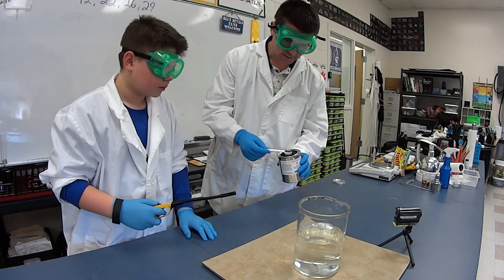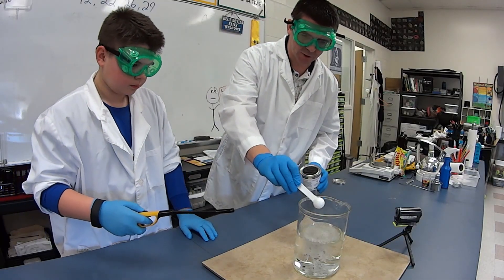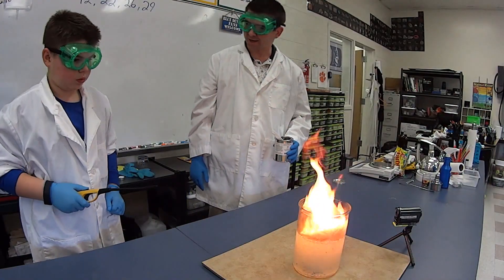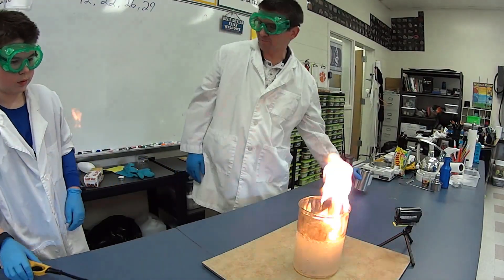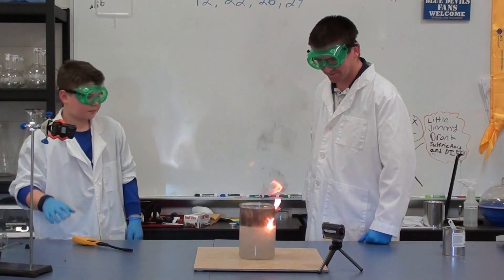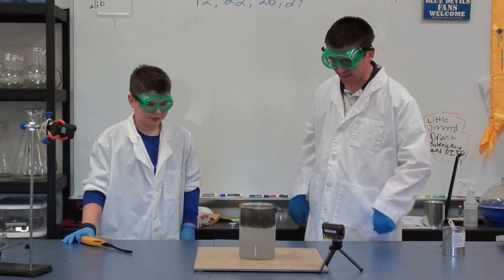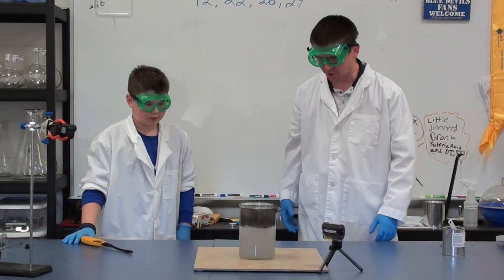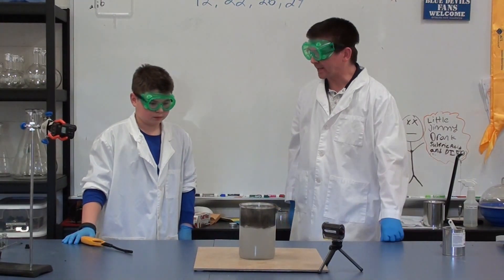All right, we're ready. We're going to add the calcium carbide. Give it just a minute. Now go ahead and light it. All right — flaming water. Pretty cool stuff, huh? And it'll kind of burn as that gas is being produced. It'll burn off — we're actually burning off that acetylene gas as it's produced.